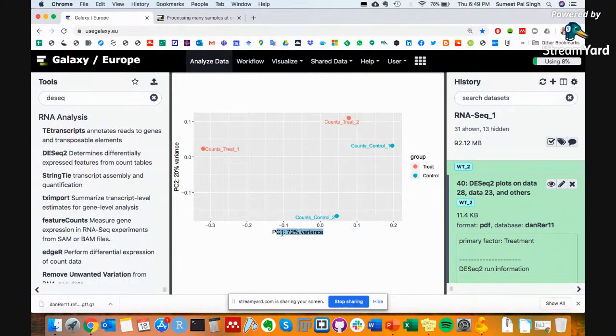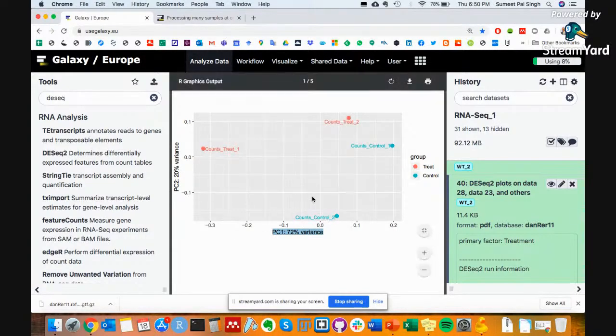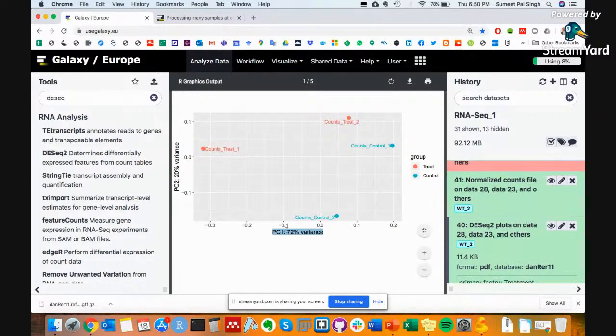That's why, when you publish or show a principal component, it's good to say how much variability it explains. It could be 90 and 10, and then the strength of difference on the y-axis could be very, very much less. It could be minor. Yeah? So also in this case here.